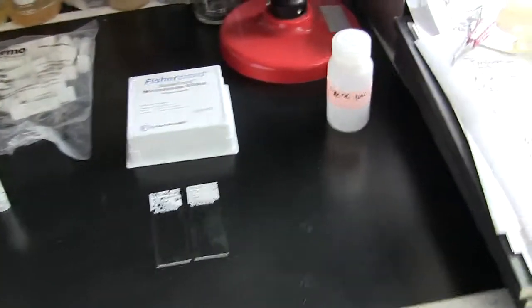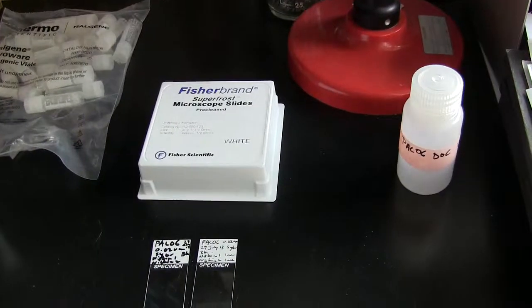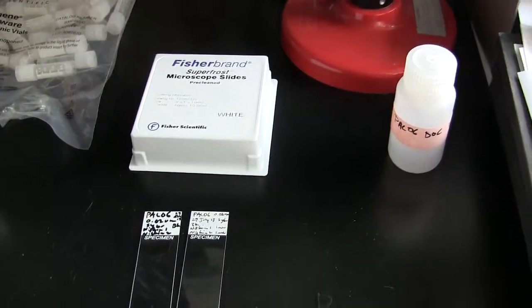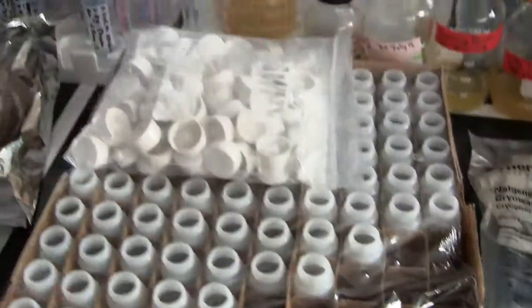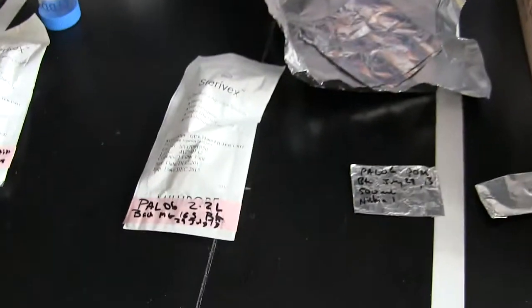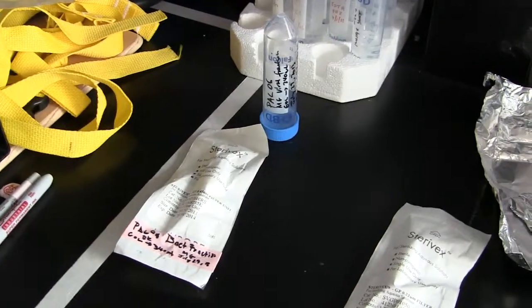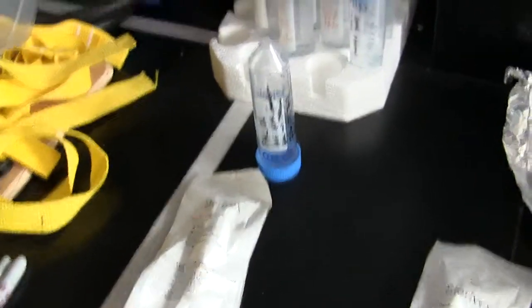Okay, so right now I'm going to go through how to label samples, ranging from DOC samples that you'll be collecting first probably with the water chemistry set, through slides, flow cytometry samples, nutrient samples, particulate organic matter samples, and bacterial metagenome 16S samples with a 0.22 Sterivex. Also, if you take a large metagenome on a given day, we'll also go through how to label viral and bacterial metagenomes taken from the large 60 liters of seawater.